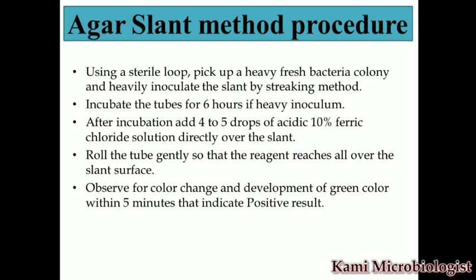Once it is streaked, so then what will you do? You will incubate it for 6 hours. Why? Because you take heavy inoculum. After 6 hours it will give you the result. And if you take a light inoculum, it will take 18 to 24 hours.